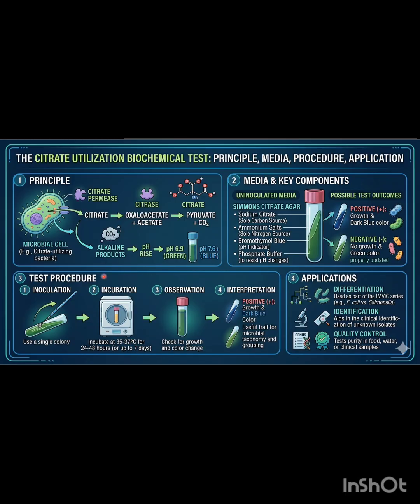After this we check for the color change. If the pH has been raised and alkaline products are formed, then it is going to be blue.